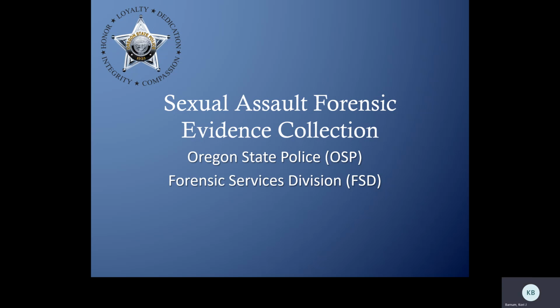Today I will be presenting adult forensic evidence, primarily the SANE sexual assault forensic kit. We thank you for your participation in this very important work.